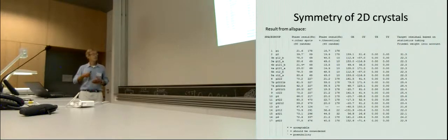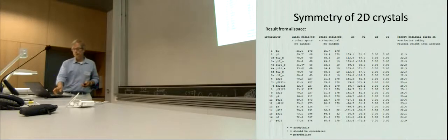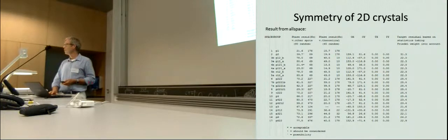So in general, choose the highest symmetry which is indicated. Maybe with one of these, we changed this to guess that we actually favored the highest symmetry and it is still accepted. Okay, but that's, I think, the right thing to do. Yes.